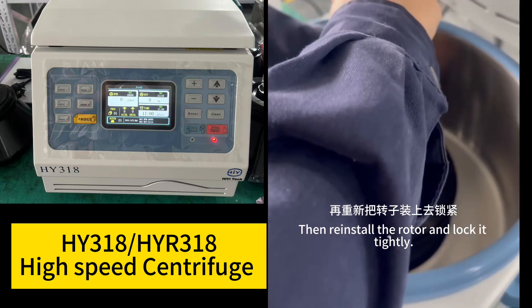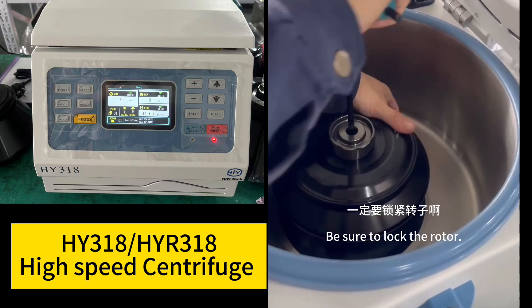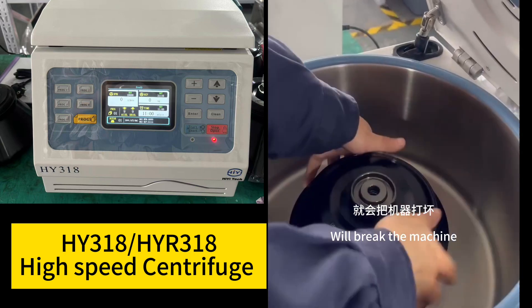Be sure to lock the rotor. If it is not locked, it will break the machine.